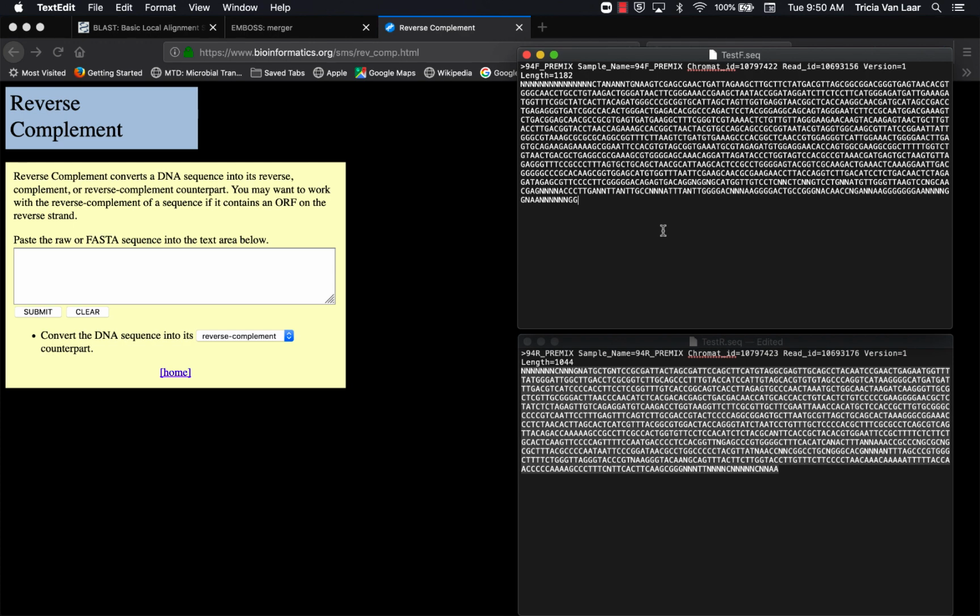The reverse primer will bind to the other strand of DNA and will amplify in the 5' to 3' direction. What I'll add at the end of this video is a little brief tutorial about how PCR works, and so what we would actually be seeing. So you'll need to understand how PCR works.